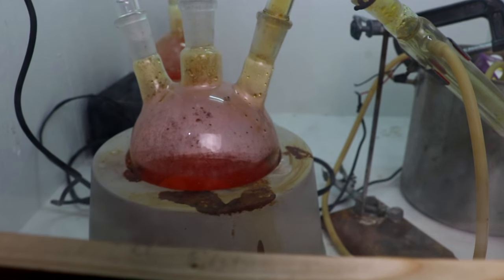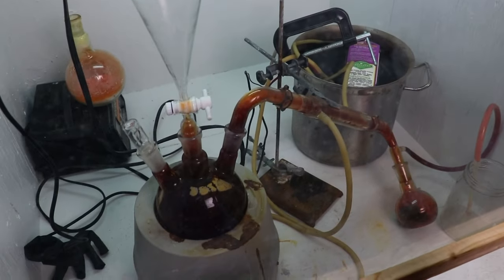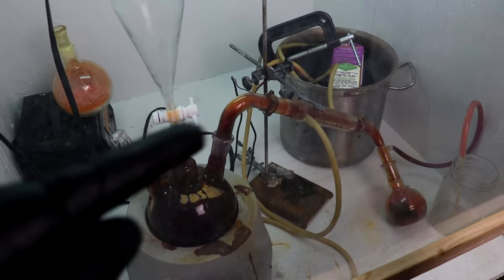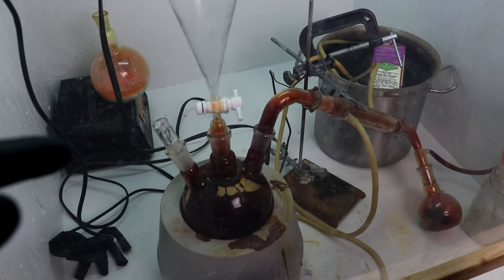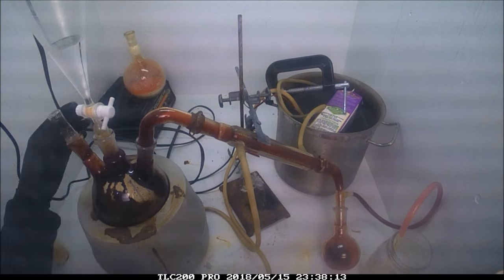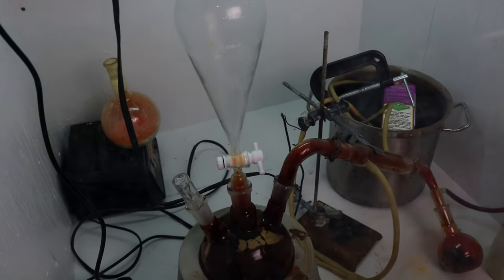Okay. There's the bromine. So you'll probably catch it on the time lapse because it was going. But I was thinking that maybe the calcium hypochlorite was being used up because the bromine stopped coming over even though liquid was going in. And so I decided to open this up and put a little bit more calcium hypochlorite in there to test it. And it turns out I was right, and a bunch of bromine vapor came out at me. But fortunately, the fume hood just took care of it, no problem.